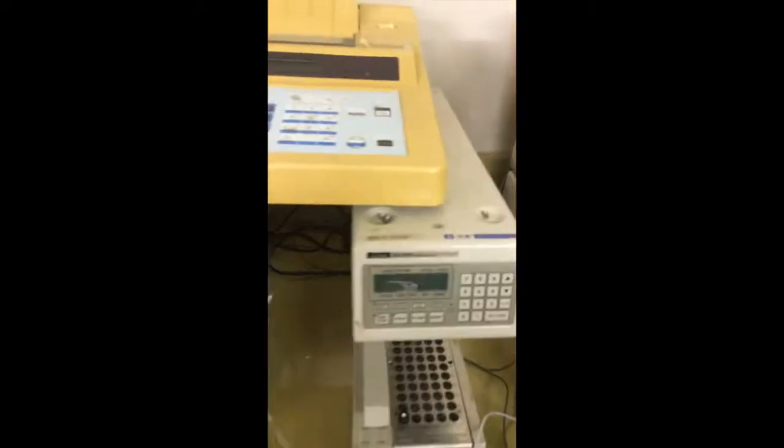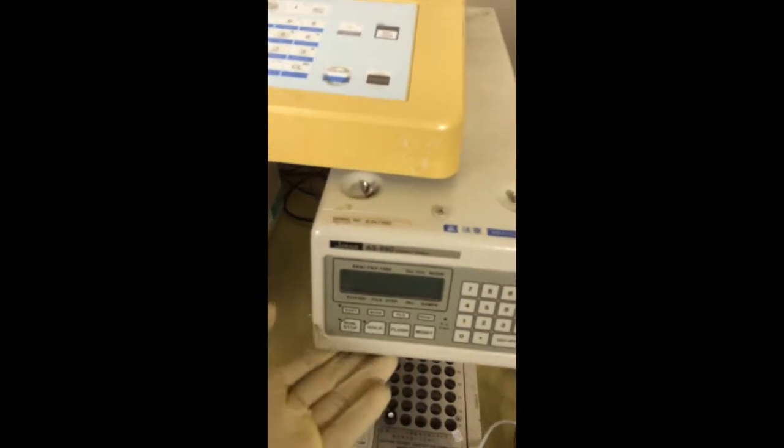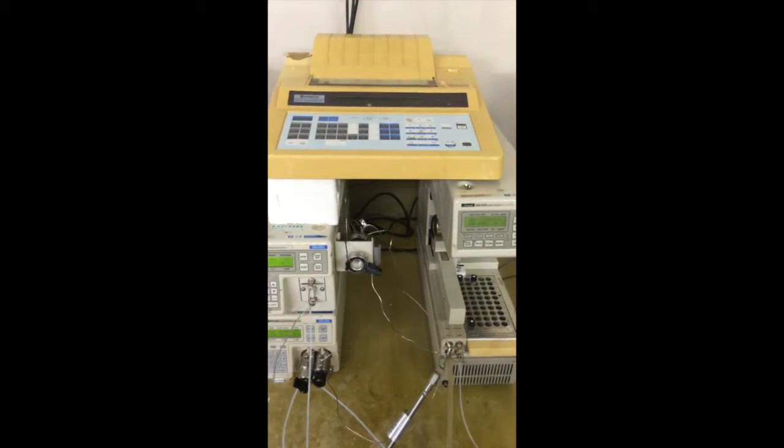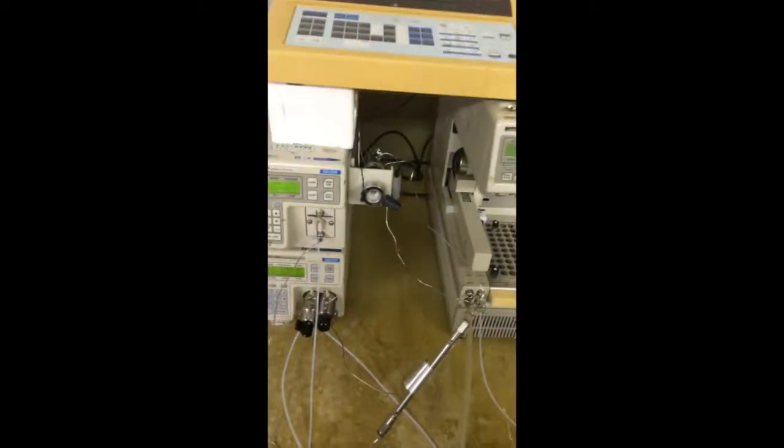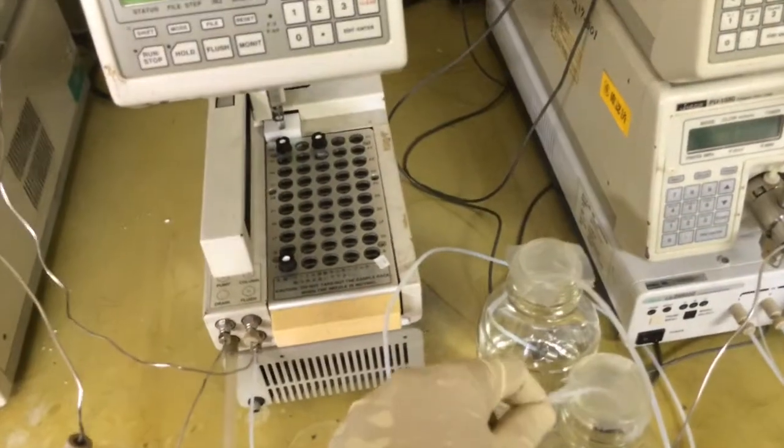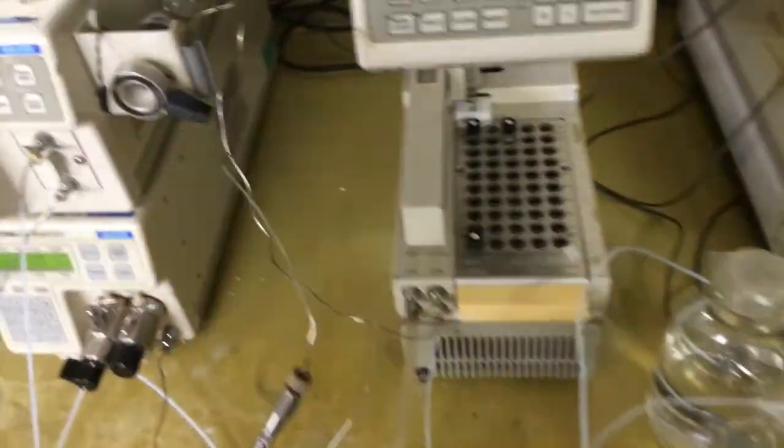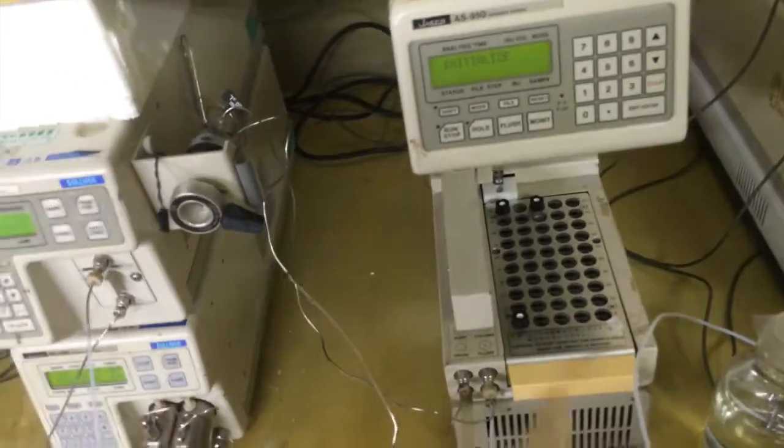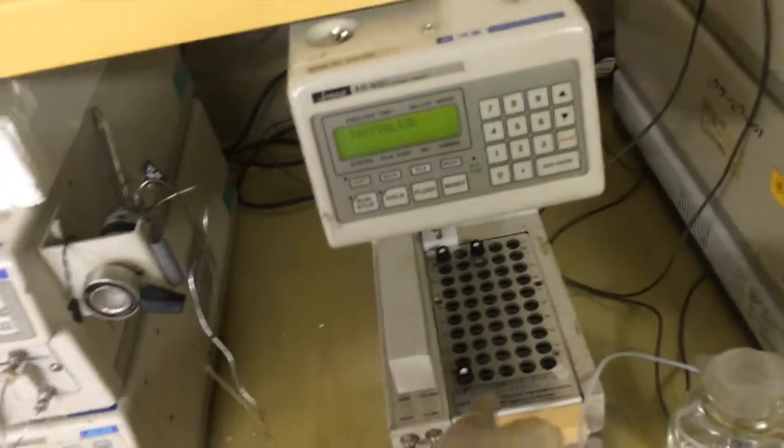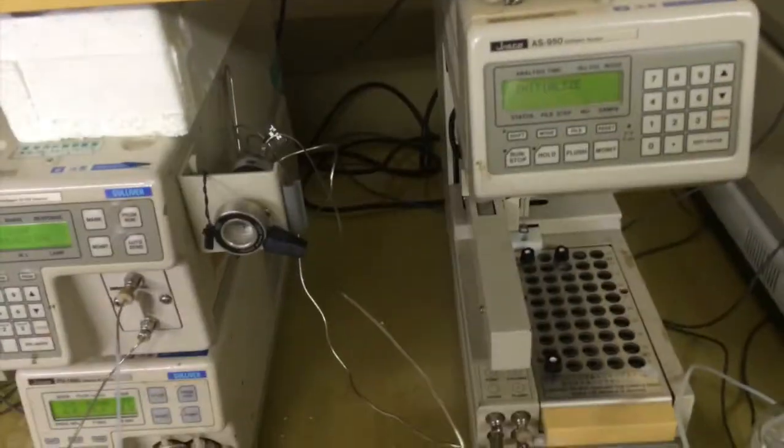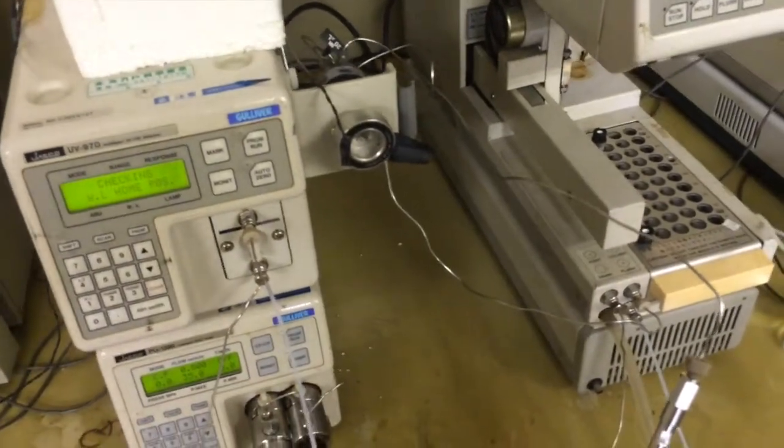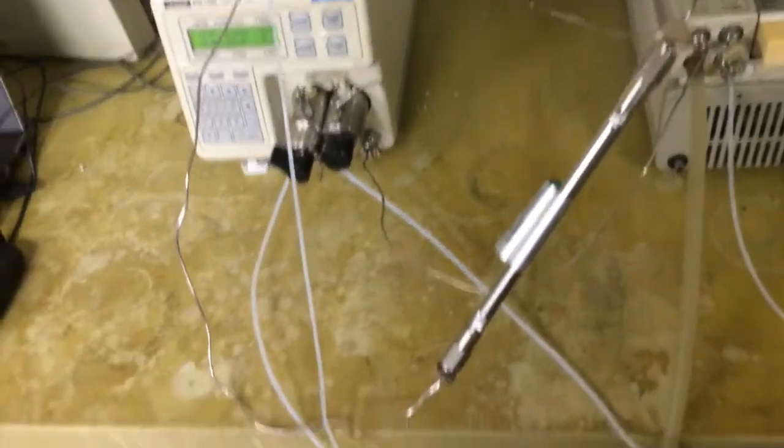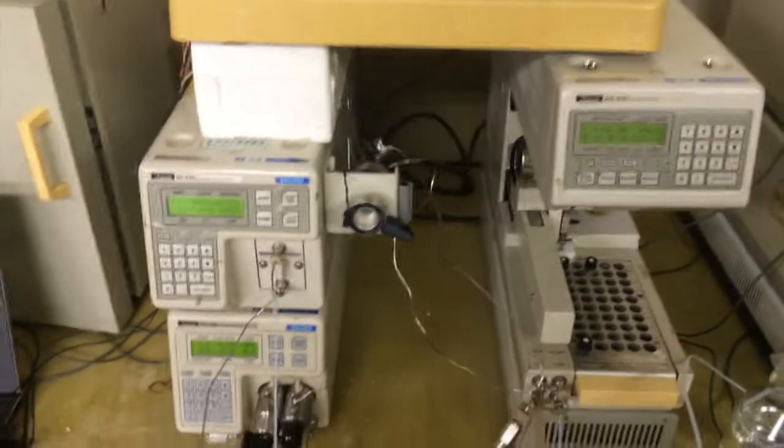Then the auto sampler, and last is the integrator. Now, here is the mobile phase, and this is for flushing the solvent for the needle. This is the output outlet, and this is the outlet for flushing.